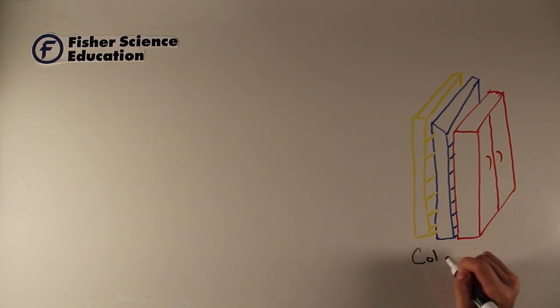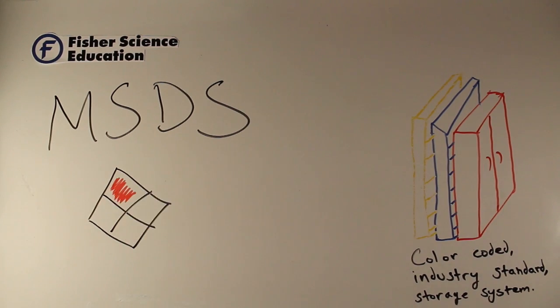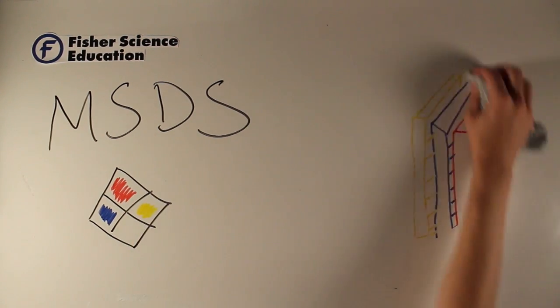Ava will tell you right from your inventory list where you should store your chemicals based off of a color code. You have instant access to the material safety data sheets of all Fisher Science Education chemicals.